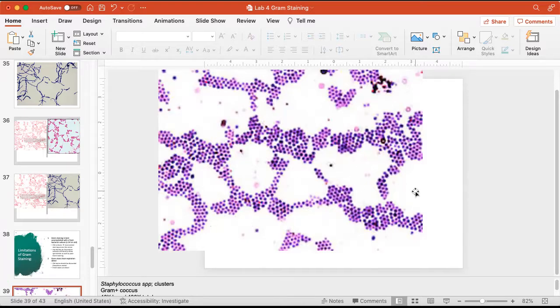And if this came from a pure sample, a pure culture, in other words, a container that I made in the laboratory that should have one organism growing in it, and I see all this debris, right away I'm going to think, uh-oh, I think this culture is getting old. I think I might have some dead cells and other waste material floating around in here.